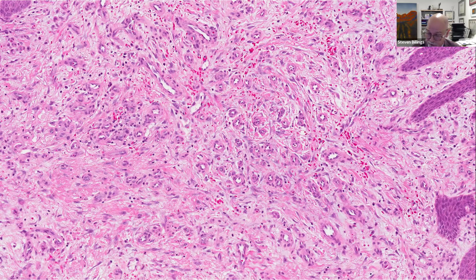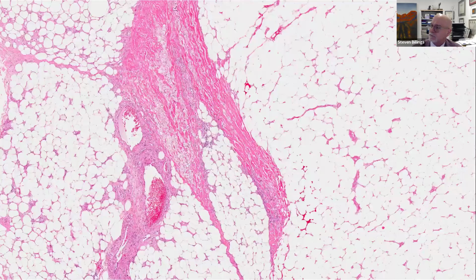That's why you get this reactive vascular proliferation. They also highlighted that you can get widened, fibrotic septae in cases of calciphylaxis, so you might confuse it with late-stage erythema nodosum. But erythema nodosum is not associated with calcification of vessels or typically with ulceration of the skin.